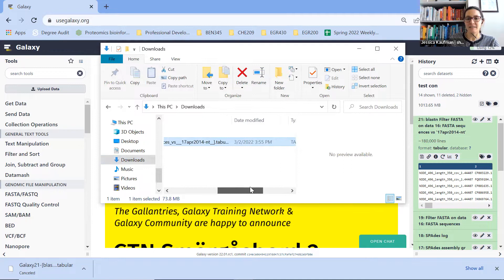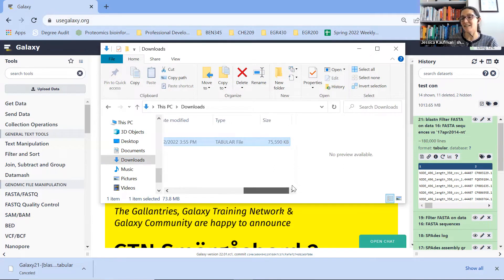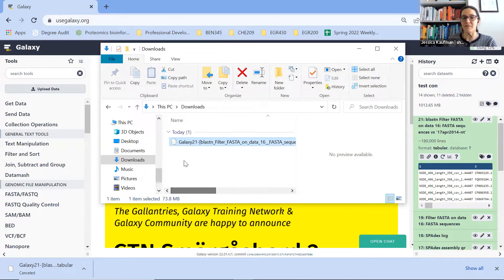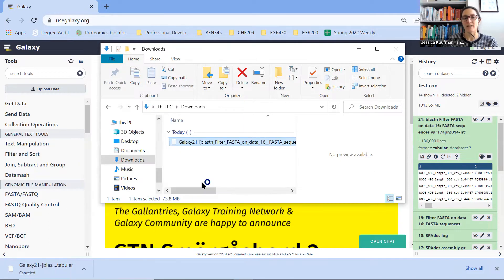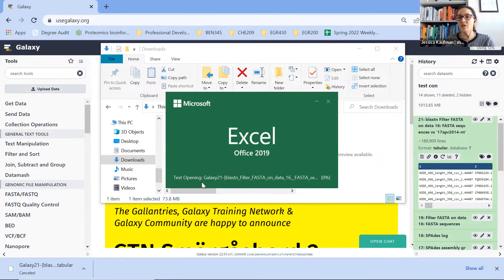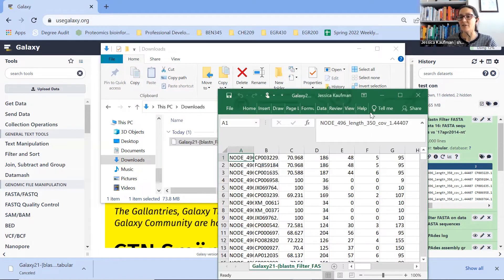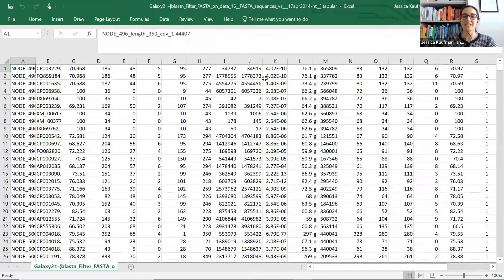I have the file here — 76 megabytes, it's a pretty big file. I can open this in Excel by right-clicking or two-finger clicking and doing Open With Excel. As an Endicott student, you have access to all of the Microsoft Office tools, so you can follow the instructions on Canvas to get a free copy of Excel if you don't have one already. Once I open it up, you can see there's a ton of columns of data and a lot of rows. It's a very large file, so we want to simplify it to be able to sort through it.